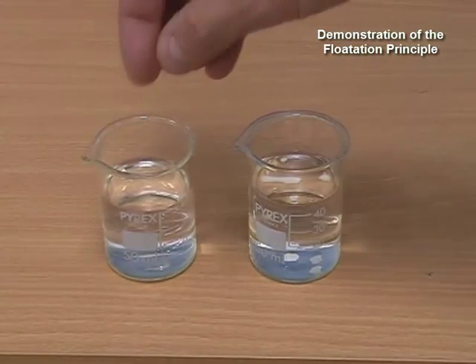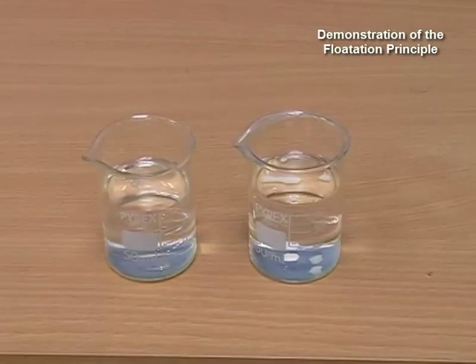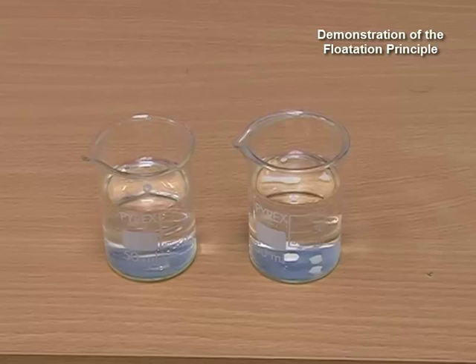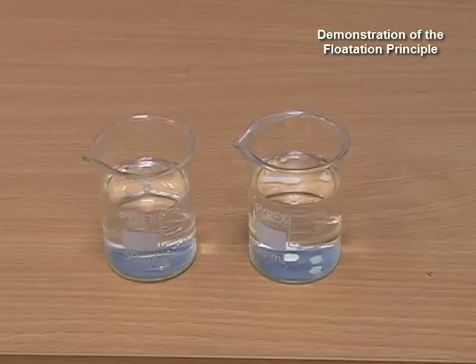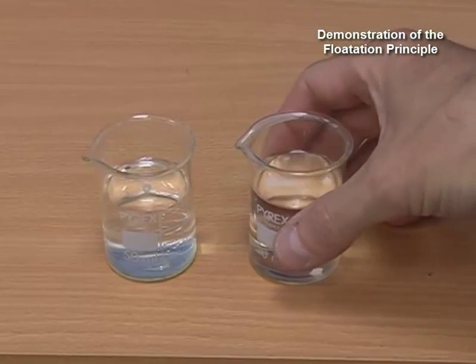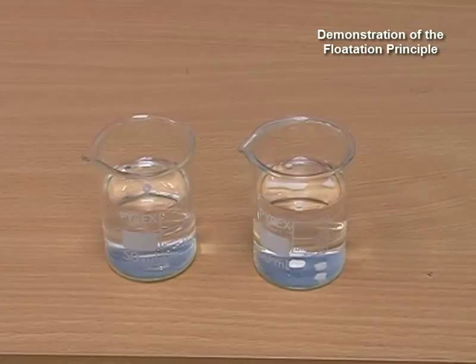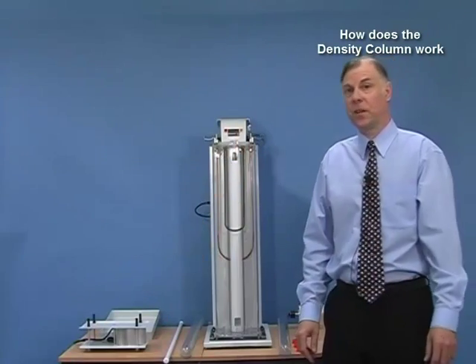If I place the same type of polymer into water, we can see that it floats. Because it floats, it means the density of the polymer must be less than the density of water, which is about 1. So we know that the density of that polymer is somewhere between 0.8 and 1. Now if we were to make different liquids — for example, replace alcohol with an alcohol and water mixture giving a density of say 0.9 — we could then determine whether the density of the polymer was greater or lower than 0.9.